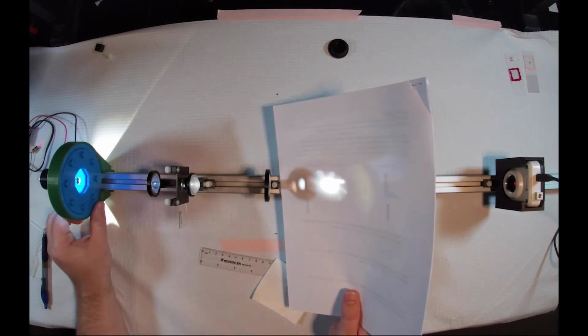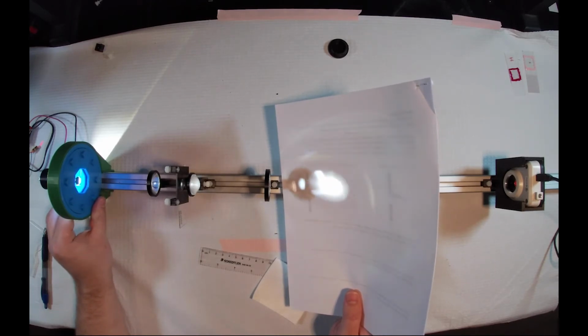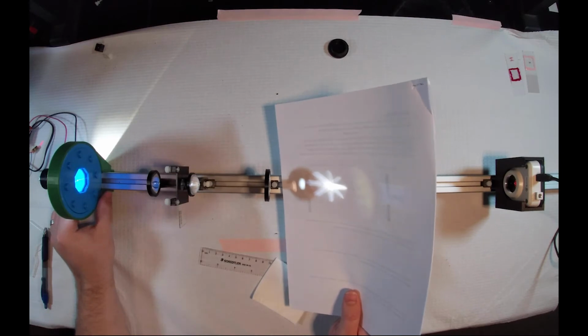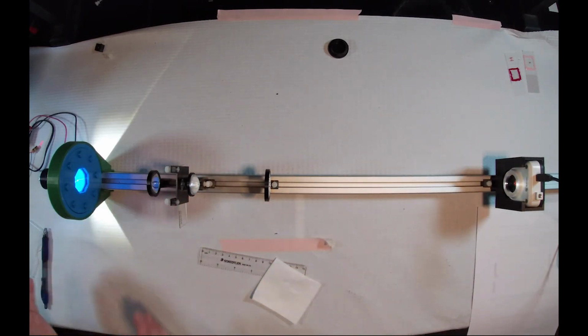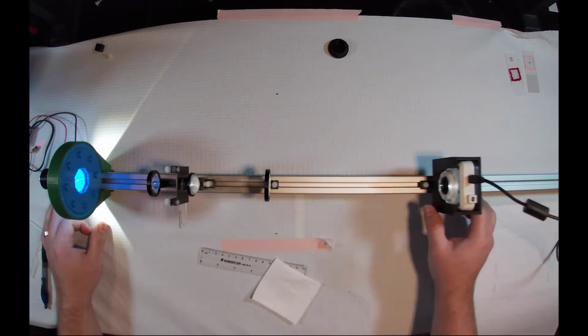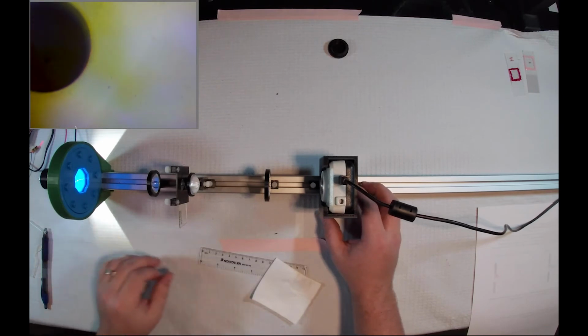that is in our plane, and because the iris is large, it can be a little bit hard to see on just the small area that our chip was imaging, but you can see a roughly in focus image of our iris on our sample. It's not perfectly in focus, and that is because we're not building sort of what we call a 3-lens Köhler microscope. I'm just going to go ahead and slide this back until our dot comes back into focus.